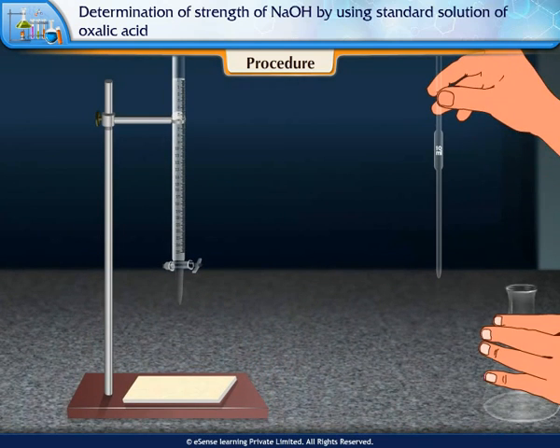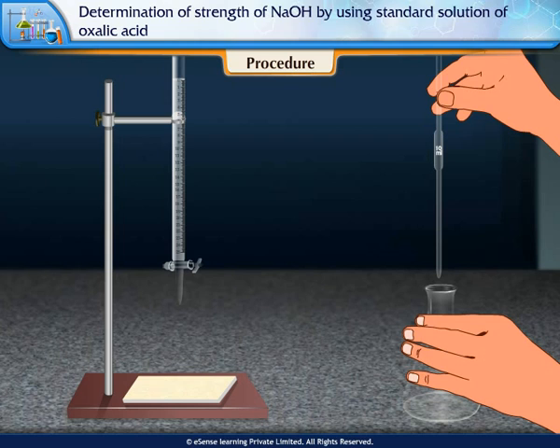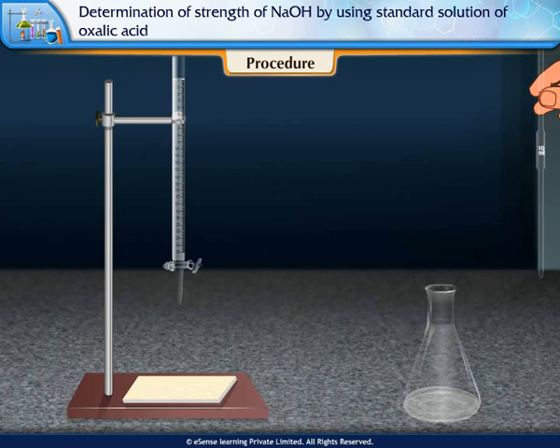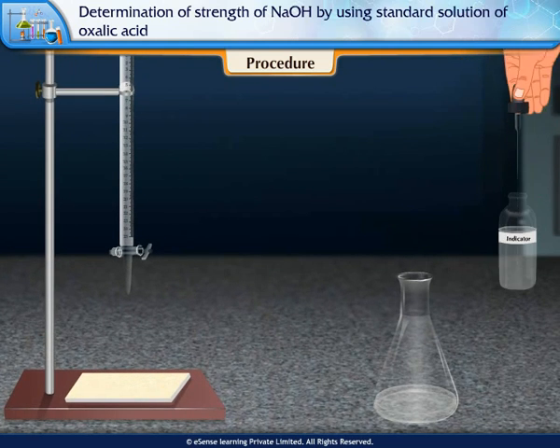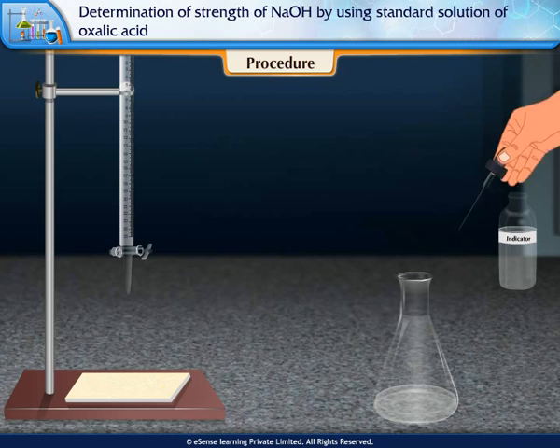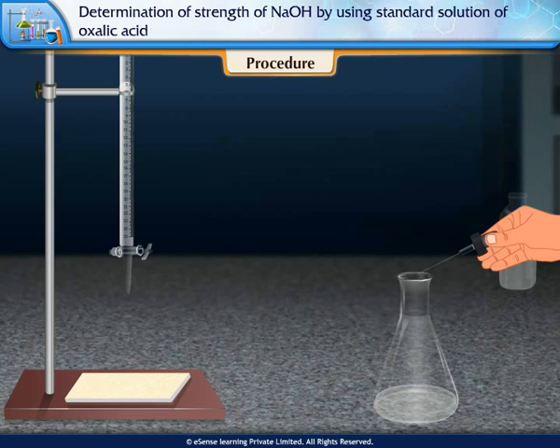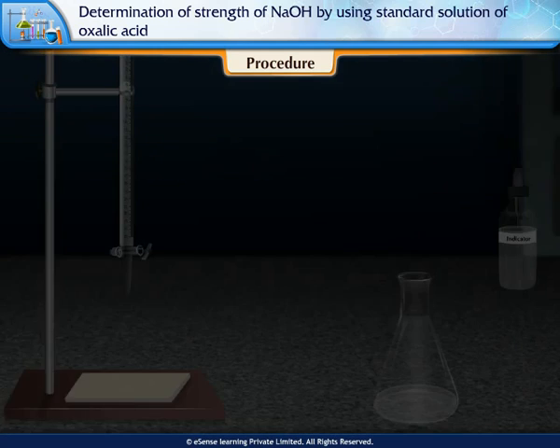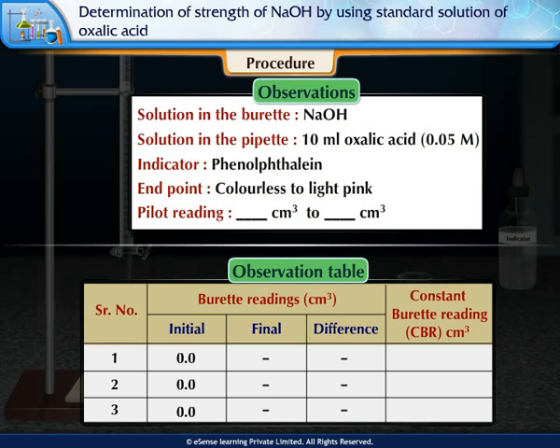Rinse the pipette with the given standard oxalic acid solution. Pipette out 10 ml of oxalic acid into a clean conical flask. Add 1 to 2 drops of phenolphthalein indicator to it. Prepare the observation table as shown.